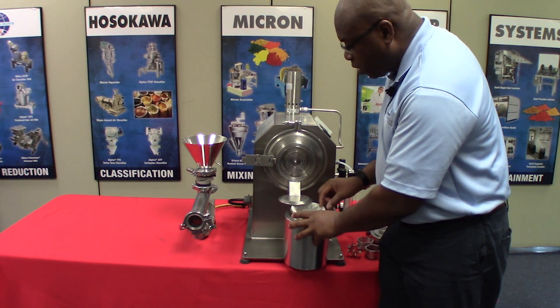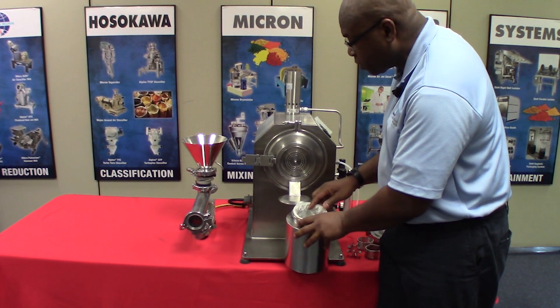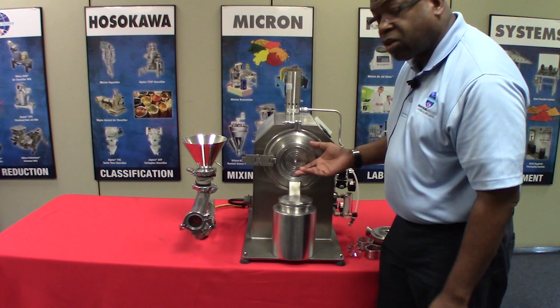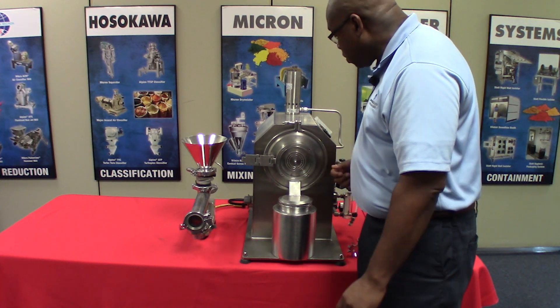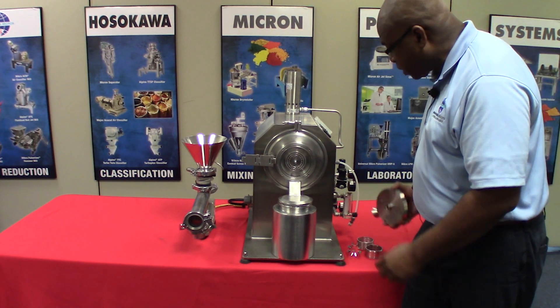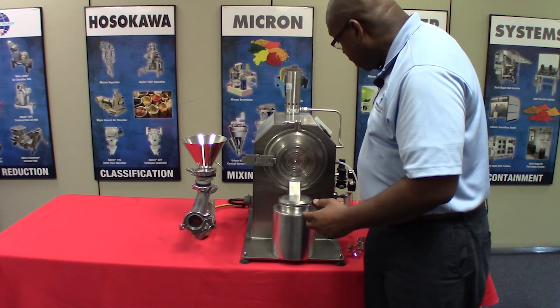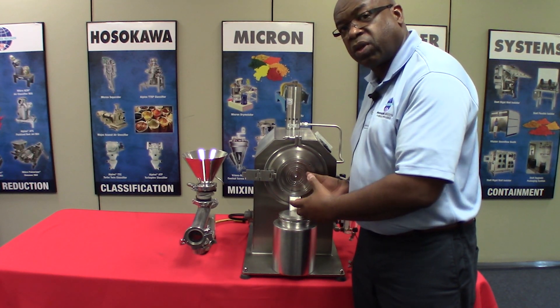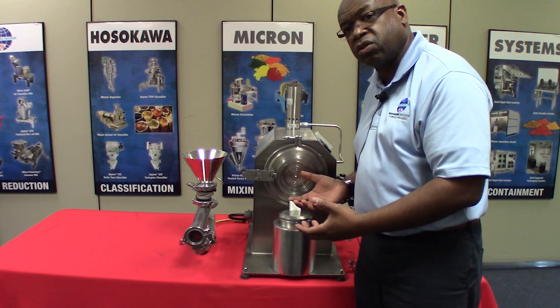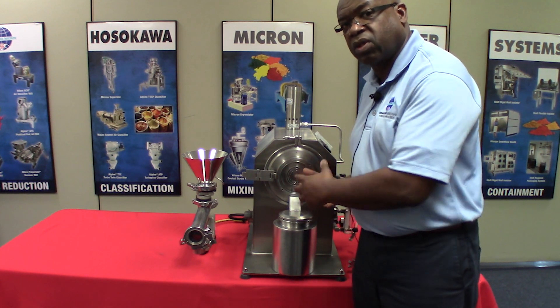Inside the collection bin here, we have a one-liter filter bag for collection purposes. This mill could also be used for cryogenic milling. From the door side here, we can attach a liquid nitrogen hose and perform full cryogenic milling. We can go down to temperatures as low as minus 150 degrees very easily with this mill.